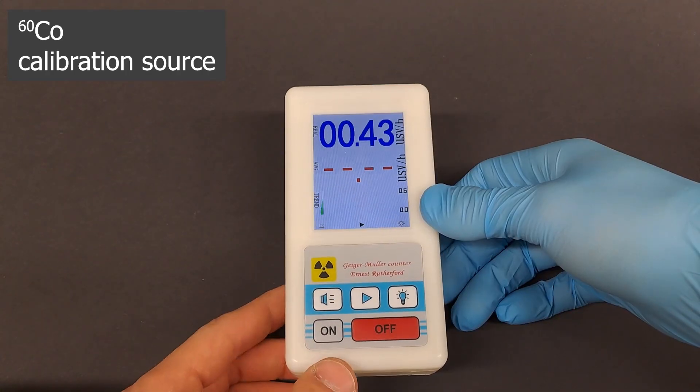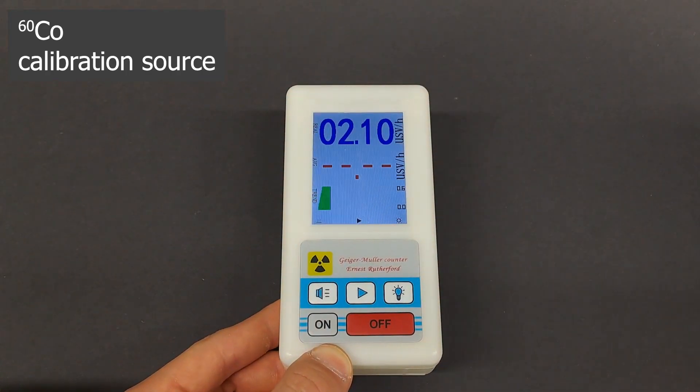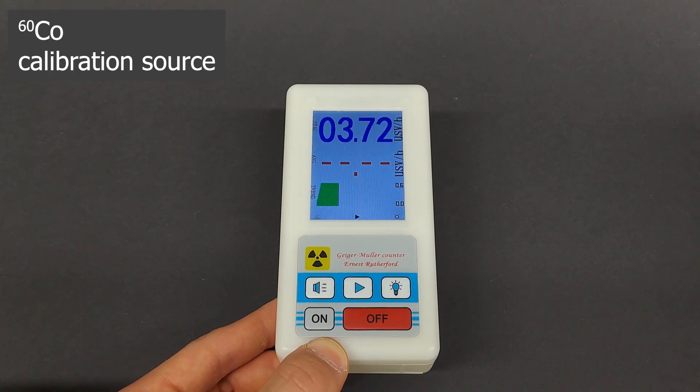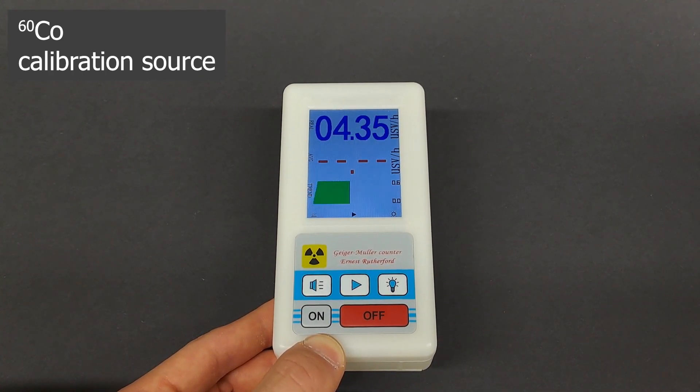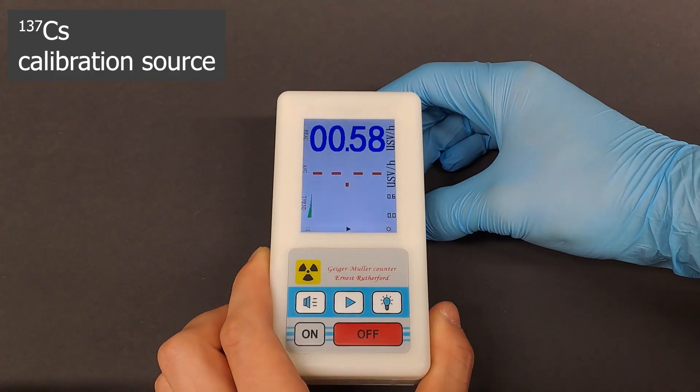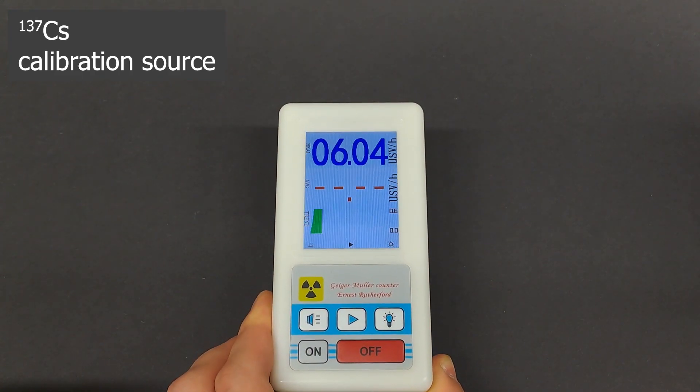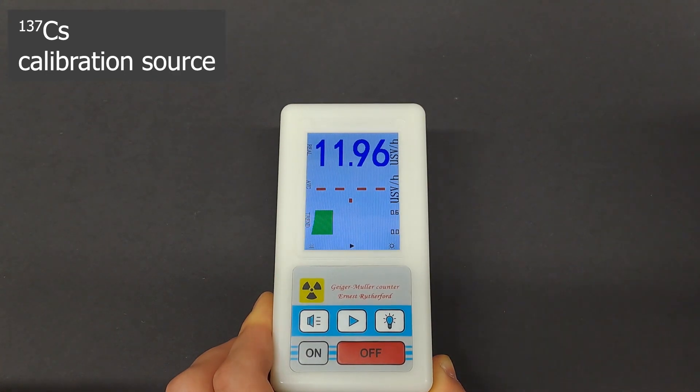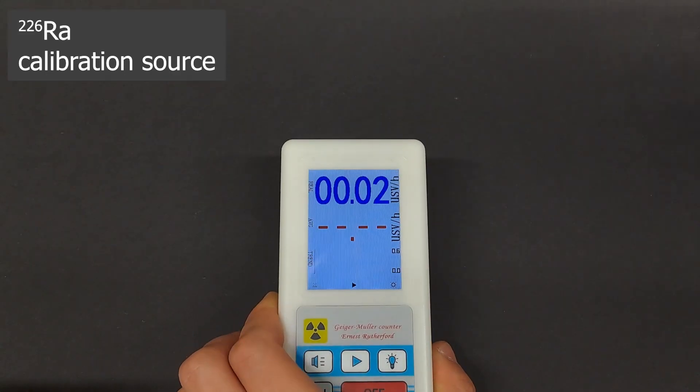Now let's use the Hobbit device, which costs around 80 euros. This measures the dose rate directly beneath the device. We can get a maximum dose rate of 4.35 microsieverts an hour. For Cesium-137, it definitely detects a significantly higher dose rate, showing a maximum value of 15.12 microsieverts an hour.